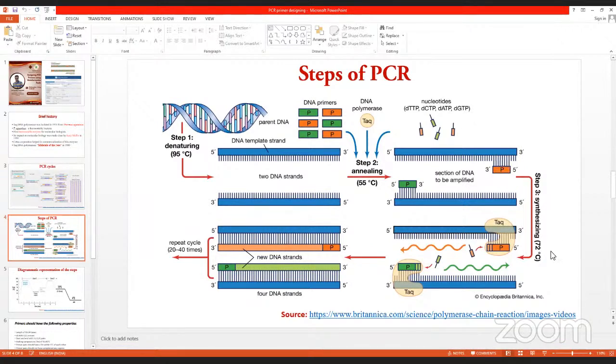This primer may have sequence complementarity with, suppose, another 10 regions of your genome. So whenever you control the temperature to its annealing temperature, the primer will not bind to your target region only. It will also bind to the other 10 regions where there is complementarity.